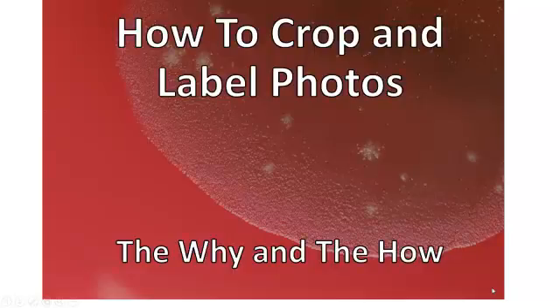In this presentation, I'm going to go over how to crop and label photos, specifically for the Biology 221 lab. I will discuss why we want to crop and label photos, and then I'm going to show you how to do it.